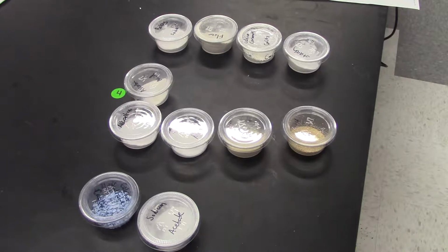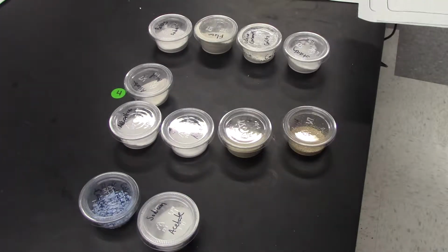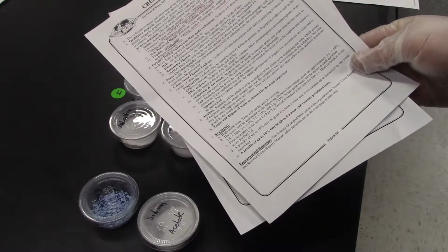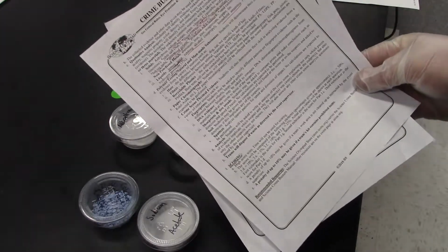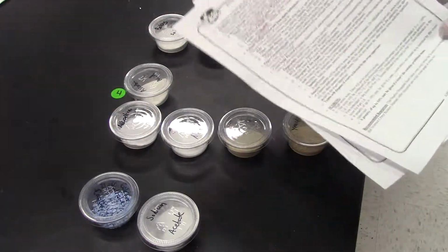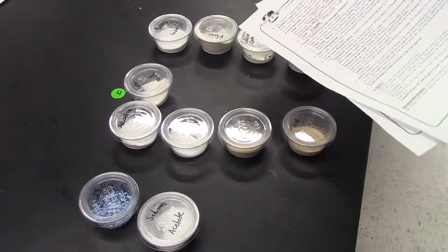If you're planning on doing Crime Busters for Division B in Science Olympiad, you need to be prepared to analyze powders. What I have here is a set of powders that were provided on the rules list found in the 2018 Science Olympiad manual. I went ahead and underlined them here, but each one of them is here. The only one I don't have in this particular mix is sand, but everything else is here.